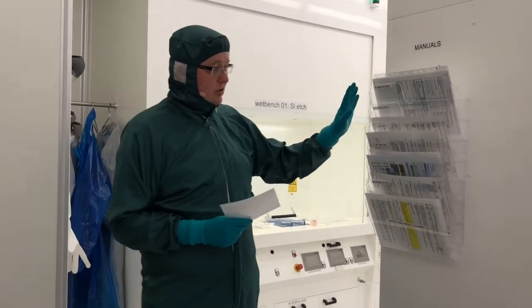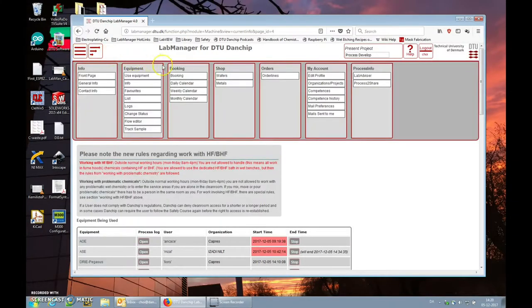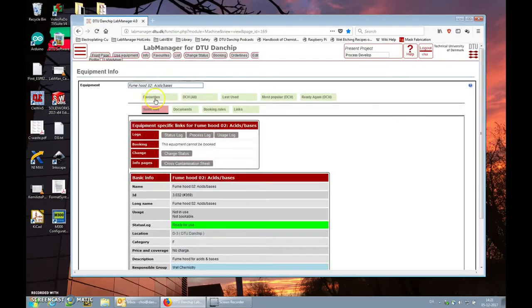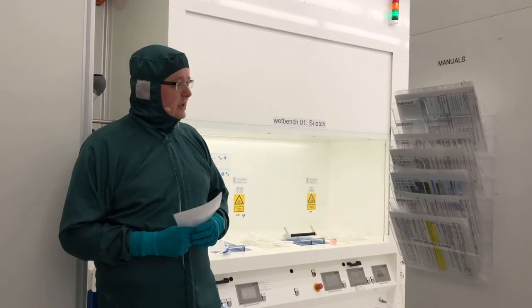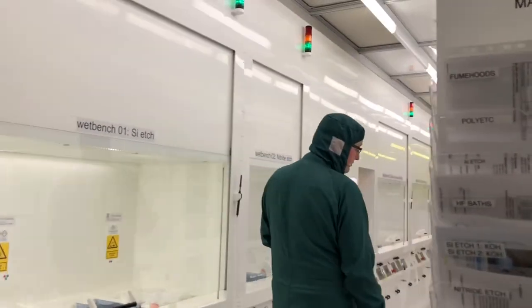You can also find all manuals online. Go to lab manager, equipment info, and find the equipment you are interested in. Go to the documents tab and there you can find manuals, APVs and other relevant information. Let's take a look at the fume hoods and wet benches we have in this cleanroom.